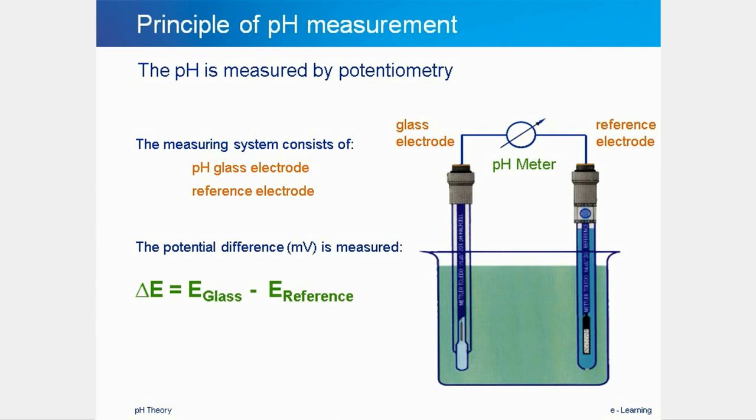To be able to use this reaction in a quantitative way, a second sensor is needed as well, the so-called reference sensor or reference electrode. This electrode is not responsive to the sample solution and has therefore a constant potential with regard to which the measurement sensor potential changes, depending on the amount of hydrogen ions in the solution. The potential between the two electrodes is therefore a measure for the amount of hydrogen ions in the solution and thus for the pH value.